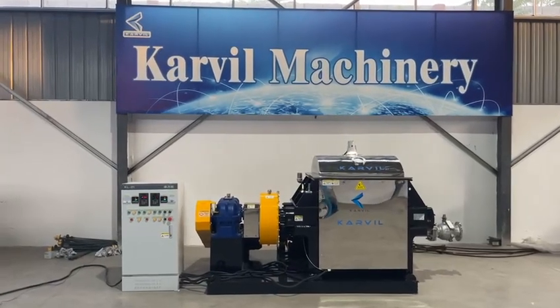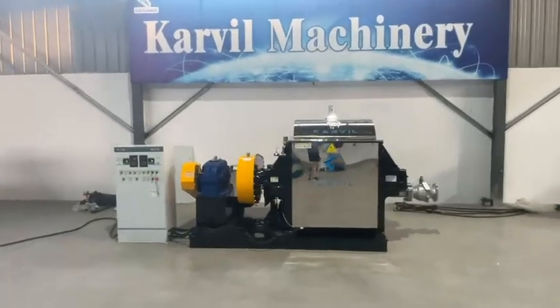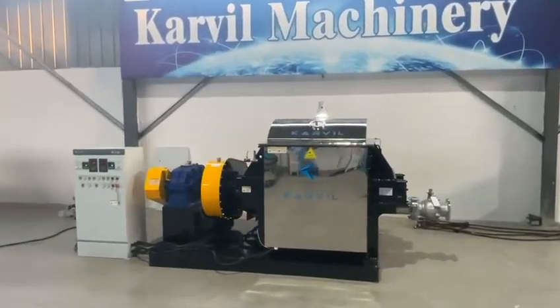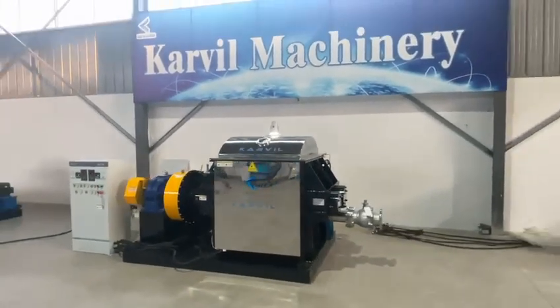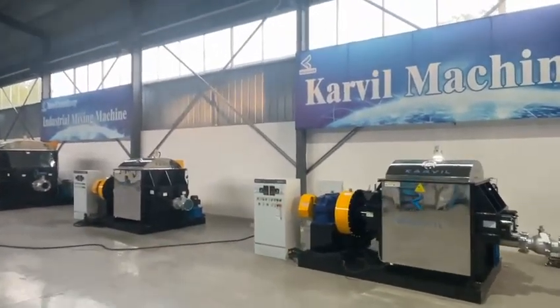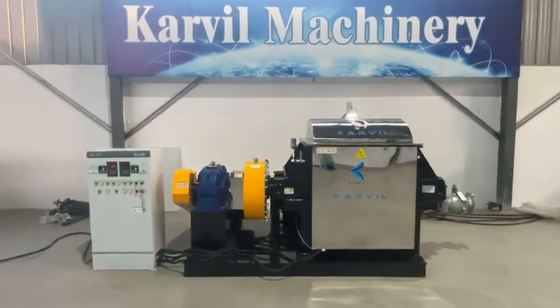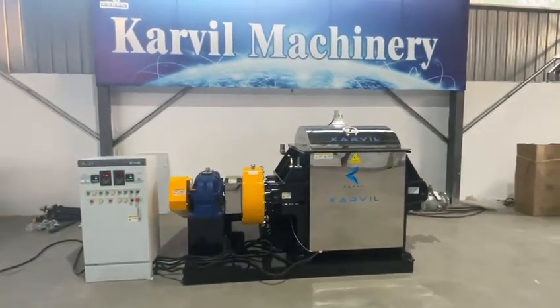Hello there, this is from Kaveh Machinery Technology Company in China. Here is a new finished 5L model needle mixer for a UK client, two pieces. And now I would like to make a test for this 5L model Sigma mixer.